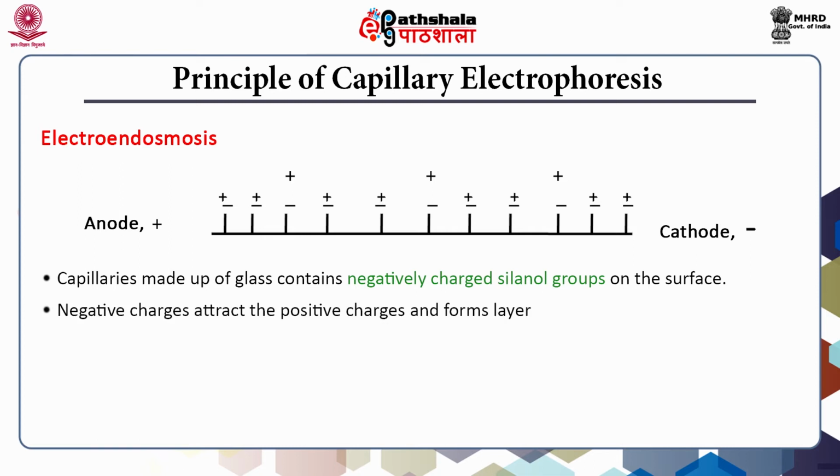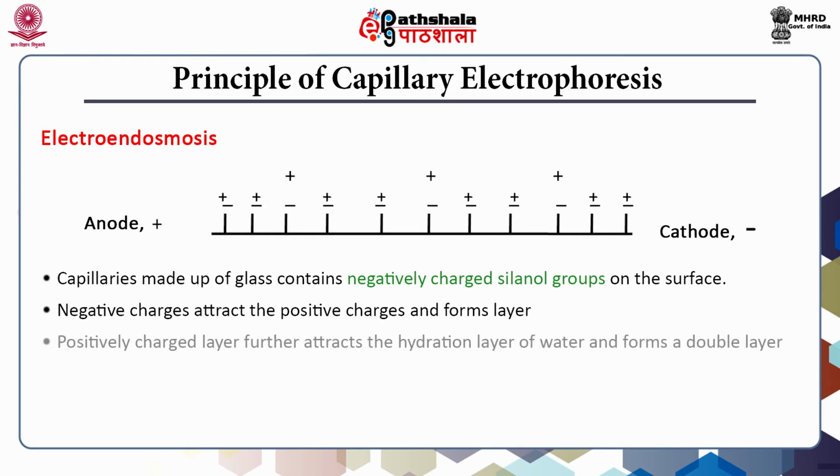This negative and positive charge forms a layer. Not all the negative charge on the dissociated hydroxyl groups is occupied by cations in this layer, and some remain unoccupied. However, these unoccupied negative charges in this layer have cations above this layer. These cations exist in hydrated form and can move in an electric field towards the cathode. This is referred to as the double layer.